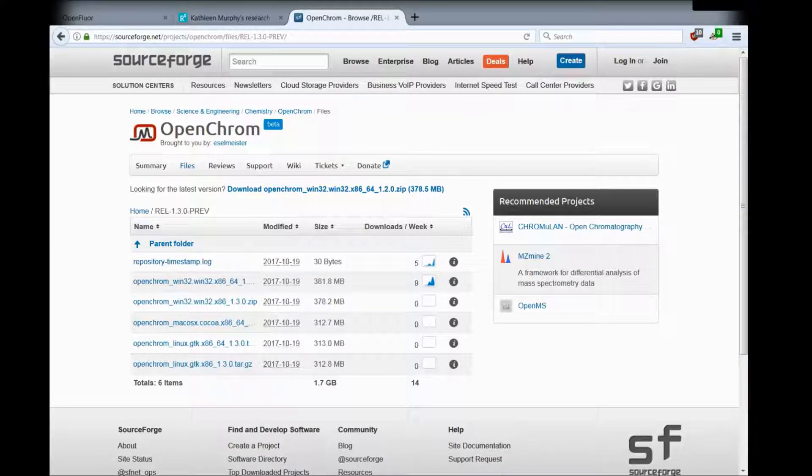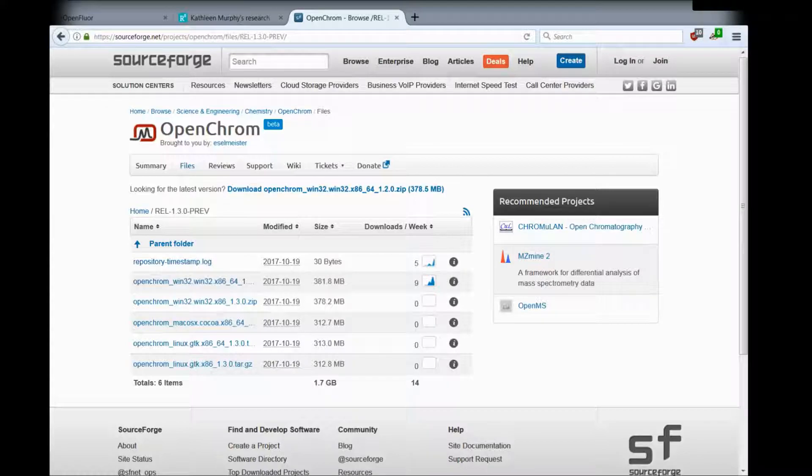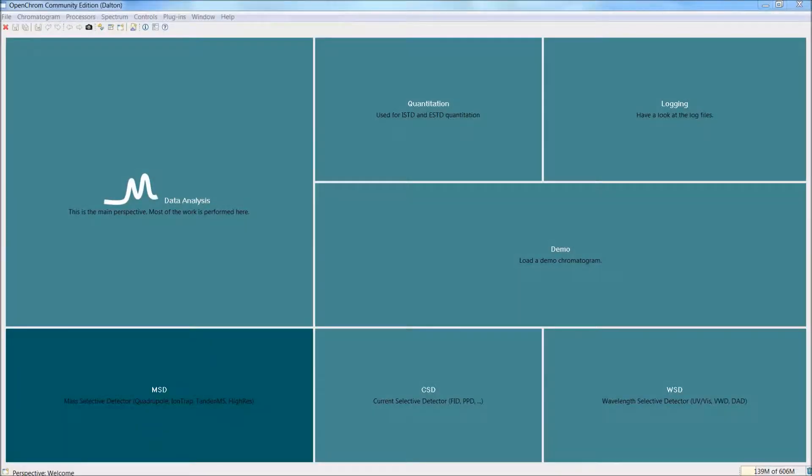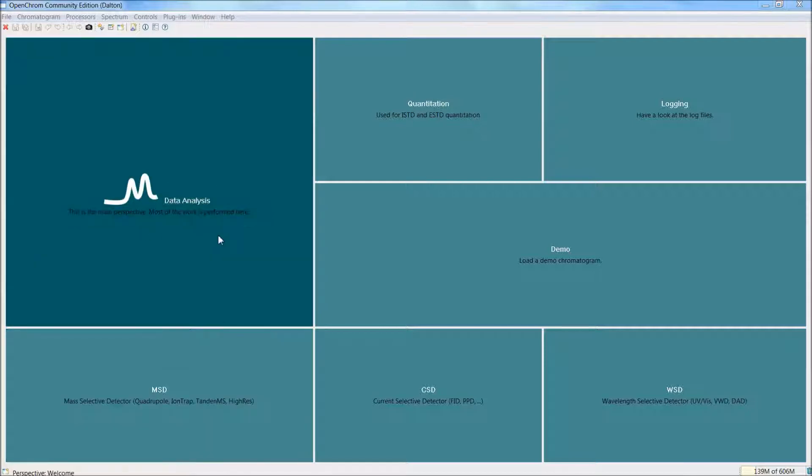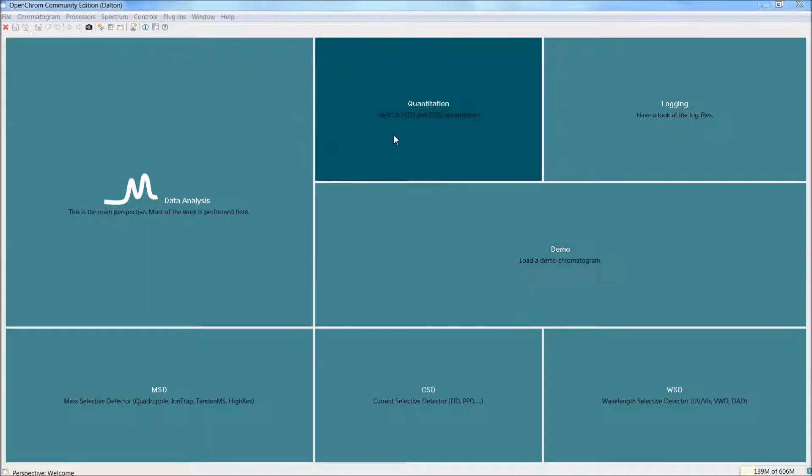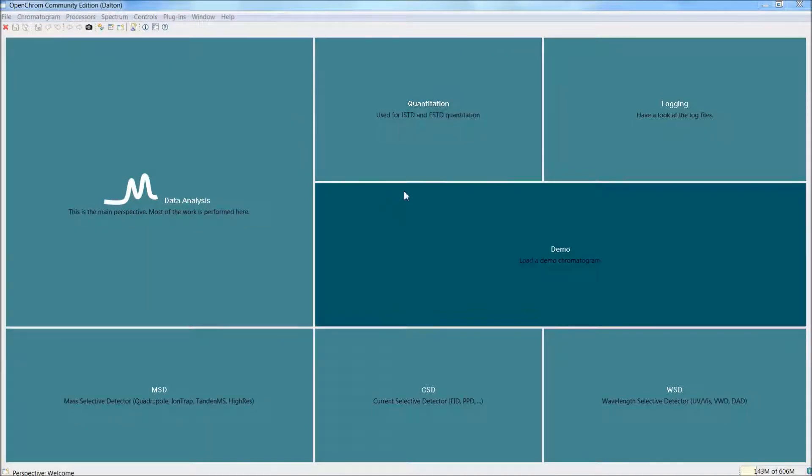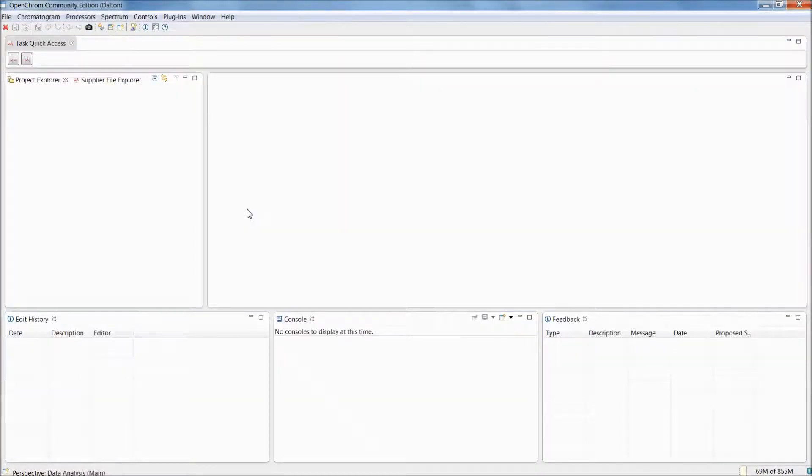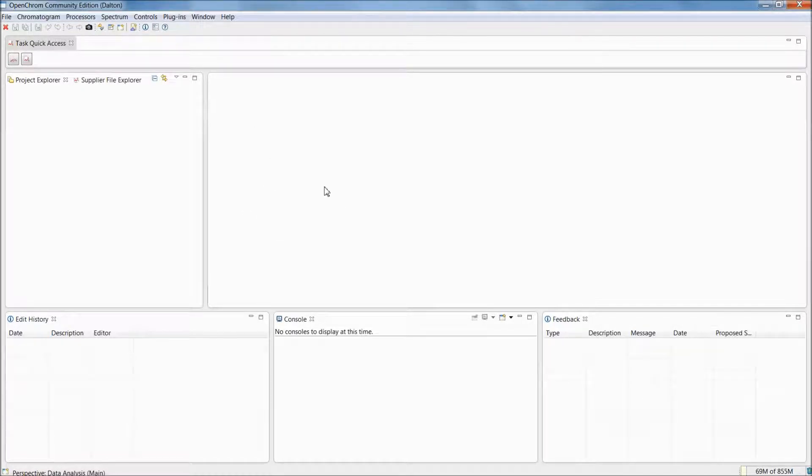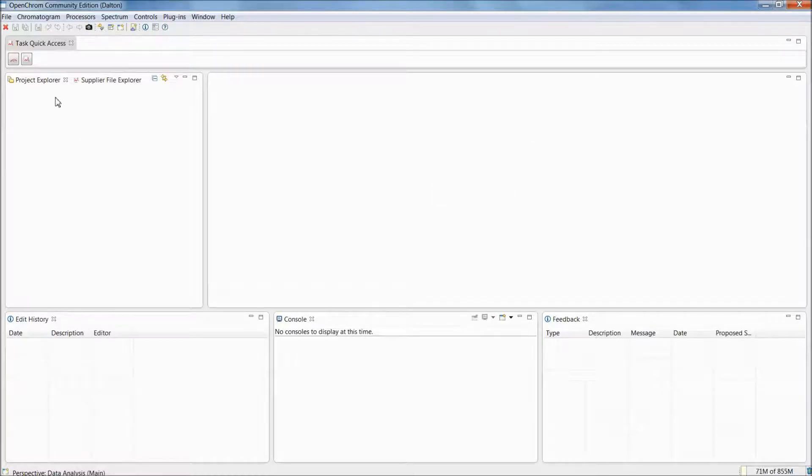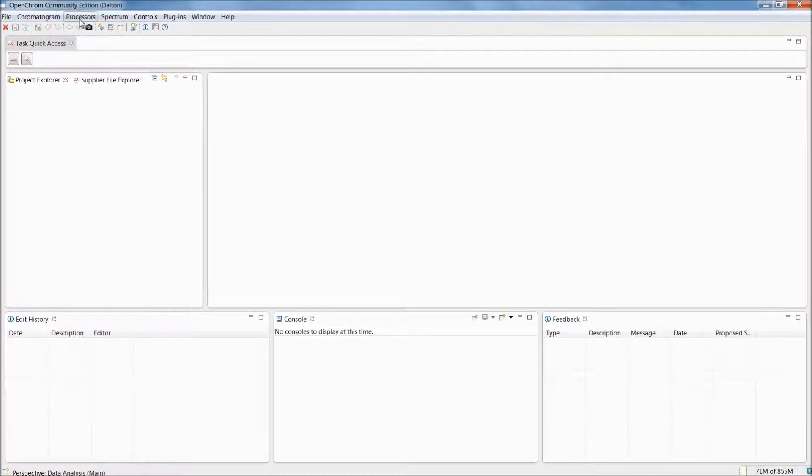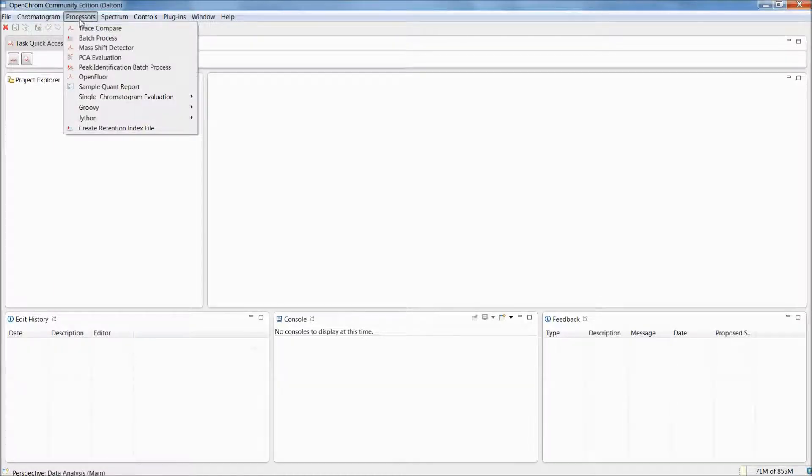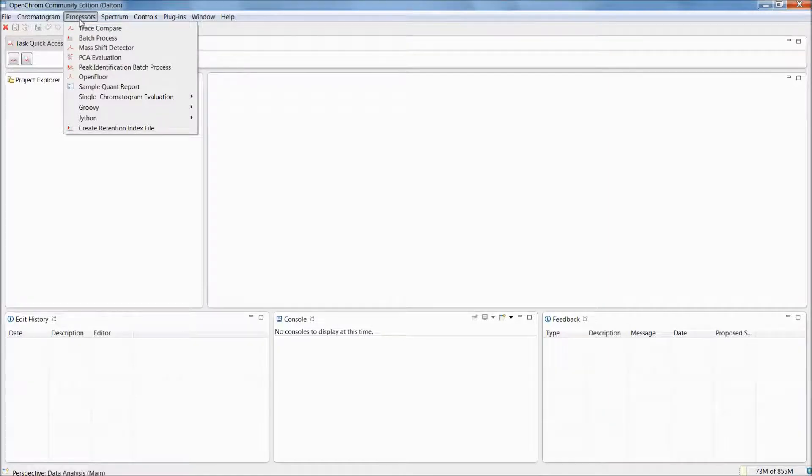If you do so and you start the software, you'll be welcomed by the OpenChrom welcome screen that features a couple of tiles. These tiles are designed to take you easily to a default view that will allow you access to its features. The tile that we're interested in is the data analysis tile. We just click with a left mouse click on this tile and the default view for data analysis opens up. It features a big empty window that's going to be filled with OpenFluor in a minute, and also a project explorer that's currently empty because we don't have any projects in this view yet. To access OpenFluor, we click on the menu item Processors and select OpenFluor.